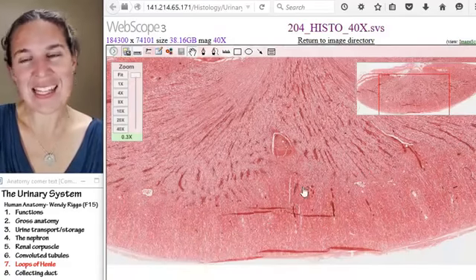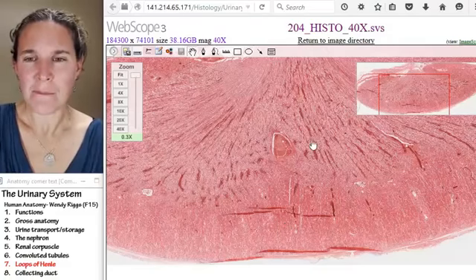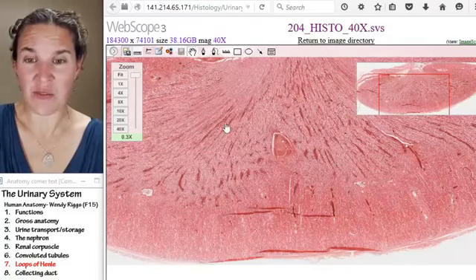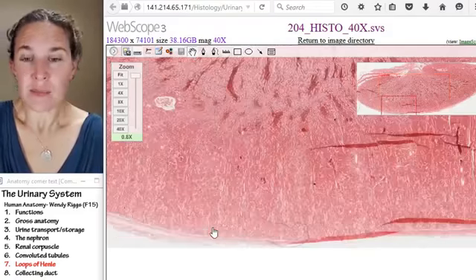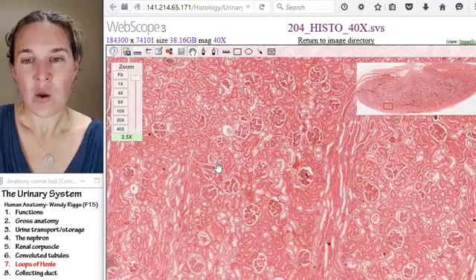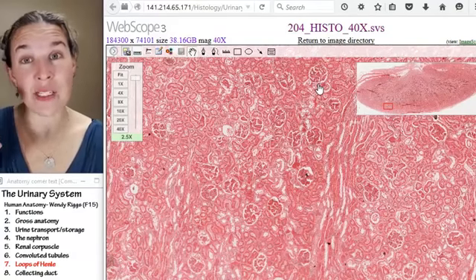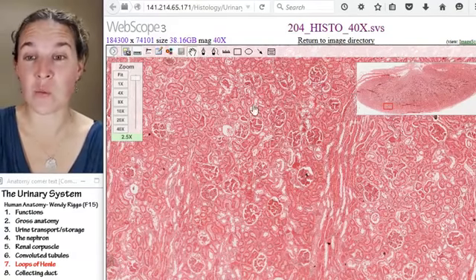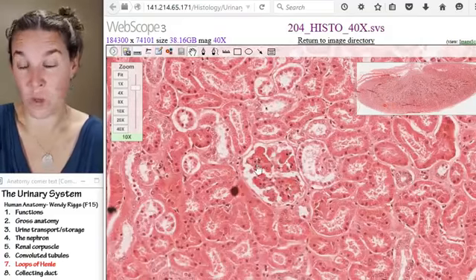So I can't see renal pyramids, and that's okay. But I can definitely tell the difference between cortex and medulla. What structures are we going to expect to find in the cortex? Well, right away we know, look, you can see them already. We know that we're going to expect to find renal corpuscles, Bowman's capsule with the knot of glomerular capillaries. And in fact, sure enough, we can.